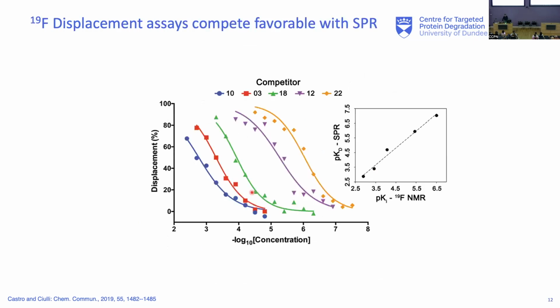Once we settled on a good spy molecule, we benchmarked those against SPR assays. So those are the results from single CPMG delay, single protein concentration titrations with a competitor, where we changed the concentration of the competitor, and we got a very good correlation to SPR assays. These assays work especially well for very weak binders, for example, from fragment screening, as long as they bind to the same pocket. And I think there is some potential for those, especially in chemistry labs that might not have access to an SPR instrument, to use them alternatively to that.